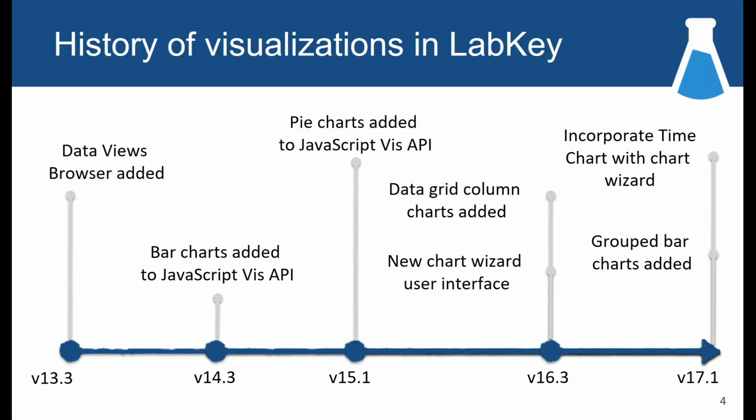And then finally, with the latest 17.1 release, we incorporated the time chart wizard that I talked about with the other charting wizard tools, so that there was a single user interface for using these chart types for data grids in LabKey. And with this, we also added some more specific chart options for the existing chart types, for example, grouped bar charts or binning for scatter plots.